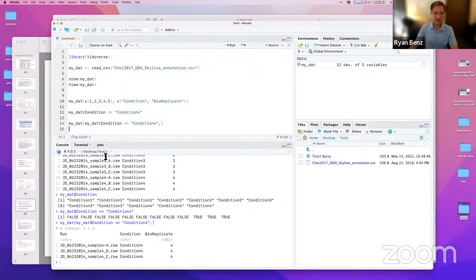All right, so that was quite a bit of code here. I have to admit, a little bit complex, but we've learned all of the individual pieces to make this happen. And so I bet you could now think of a way to read a protein table into R that you have with your own data. I could imagine you being able to, with some of these examples and going back and looking at some of them, take your table and filter it to get peptides and proteins that have a false discovery rate of less than 1%, or have a mass to charge ratio bigger than some value, or peptides that elute in a given elution time in your gradient.